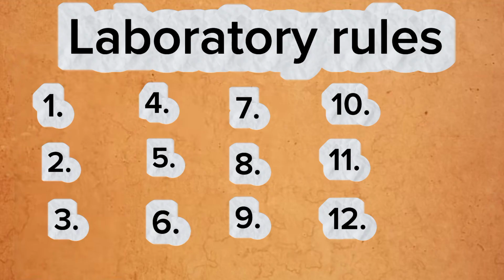Before I close this chapter of rules to be observed in the laboratory, I would like to remind you that we said that a standard laboratory has large windows and doors. Why do some laboratories have large windows and doors? The answer is to increase air circulation. They also act as an emergency door to provide an alternative escape route in case of fire outbreak.